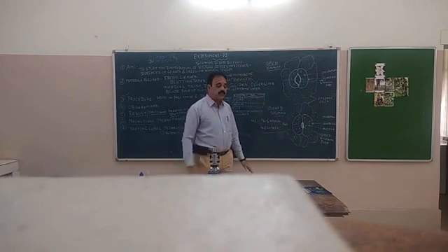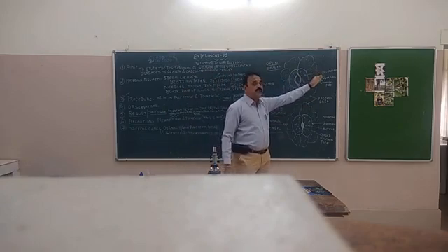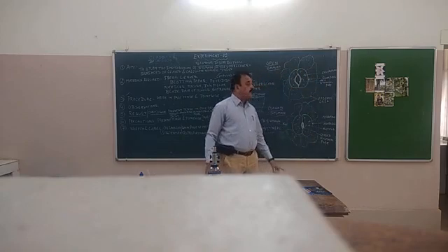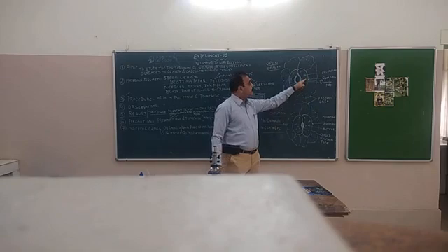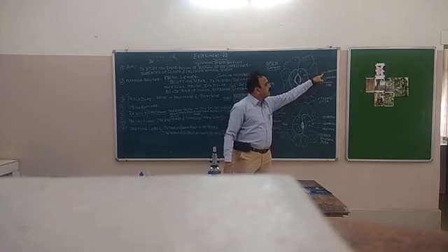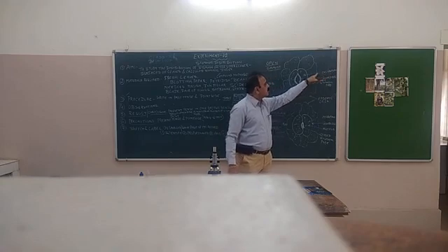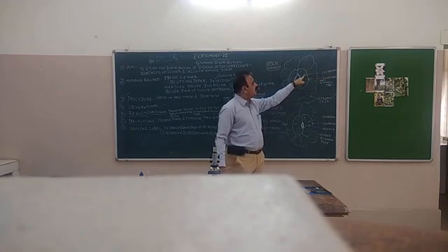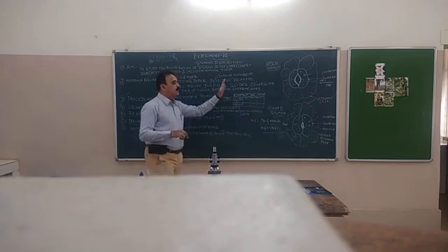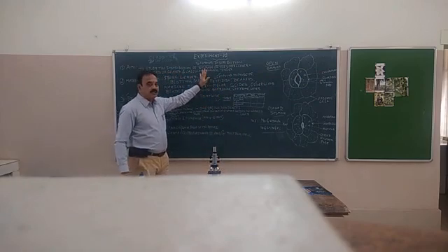While labeling also I told you, try to label on one side. Don't put labels at 360 degrees. And also, when you are labeling, the arrow mark should be towards the part, not reverse. So that when I am reading, see, chloroplast, the arrow mark is indicating that this is chloroplast. So arrow mark towards the part. If you present this in your record, that will be good.